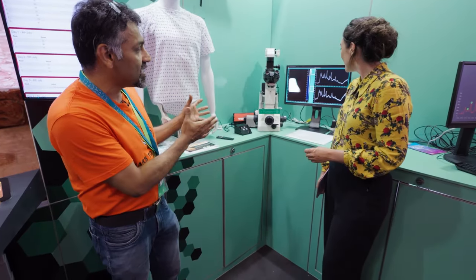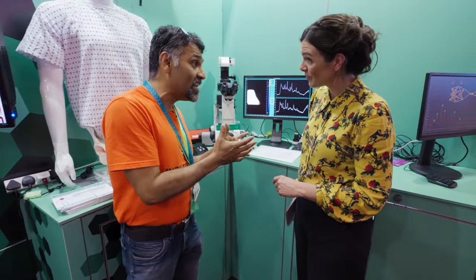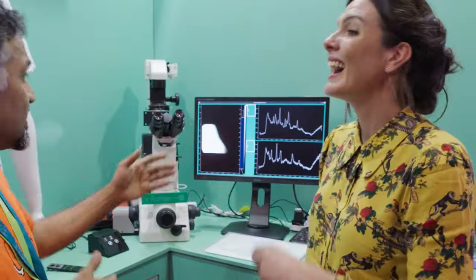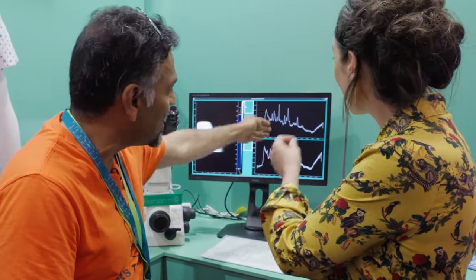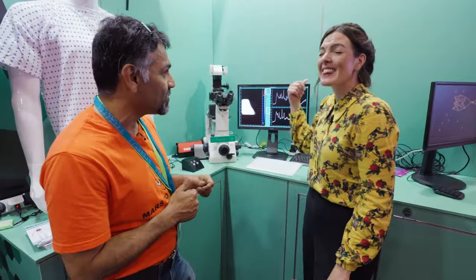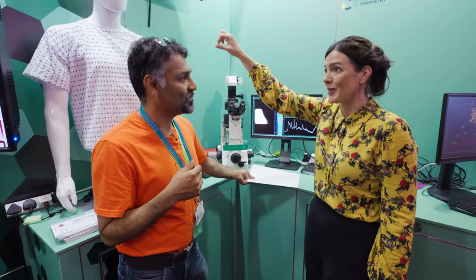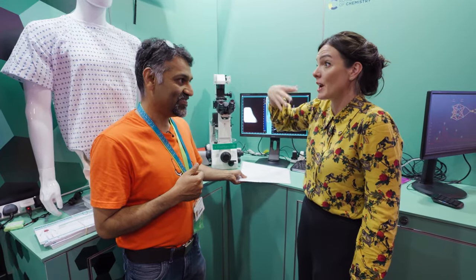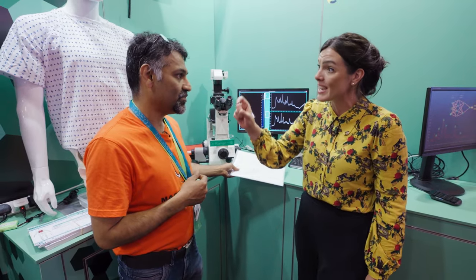This chemical fingerprint acquisition, as you just saw, can happen on Mars, which is happening right now. We use that idea to diagnose diseases much, much earlier than they manifest themselves. So we are looking at diseases like osteoarthritis, and you see that there are different fingerprints. This is how the fingerprints look. These peaks correspond to the vibrations, and a spectrum corresponds to the chemical fingerprint. That is absolutely fascinating. So you can use the same technology that they're using with the Mars rover to analyze the chemical fingerprint within bones when it comes to osteoarthritis to detect the disease before the person that has it might even know. That's exactly correct.